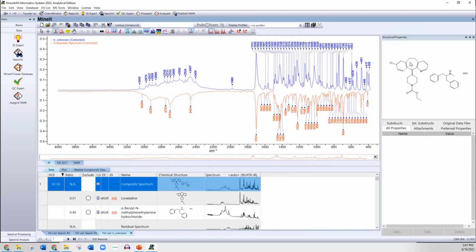And we can see from the right-hand corner, it thinks that it probably has the carboethoxy group for the carbamate, which we thought we saw and is consistent with our mass spec data. But it also sees this hydrochloride salt. But of course, when you're doing infrared data, you're not really looking for exact structures in many cases. You're looking for features in the compounds present that would give you an idea of what your unknown might be. Well, it did find our carboethoxy, and it says it's a salt.